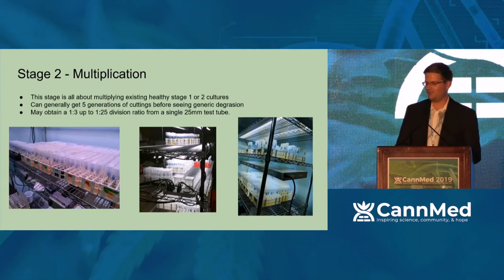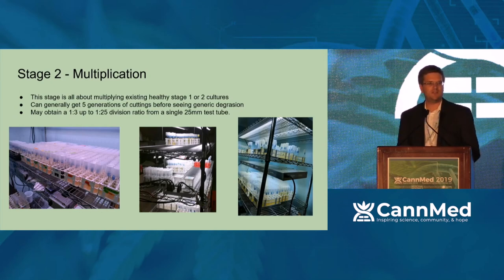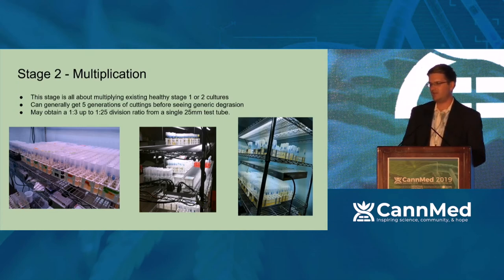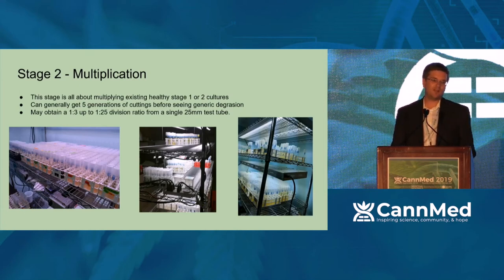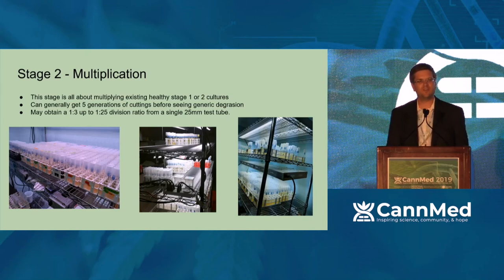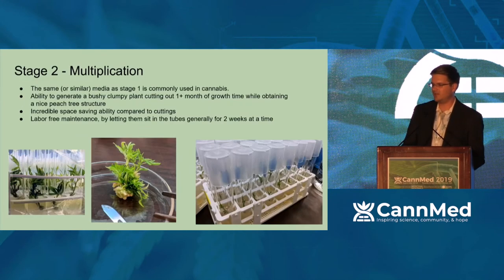So the stage two is the multiplication stage. I was typically getting a 1:3 to 1:8 division ratio per culture every single time I did this. And that culture media only cost a couple cents a piece, so it's virtually free to do once you set up the lab. Now, you only want to keep a plant in stage two, or I guess in culture, for no more than 5 generations at a time. If you do more than that, you start to get genetic degradation the same way that holding onto a 20-year-old cutting would have. So, just not a good idea.